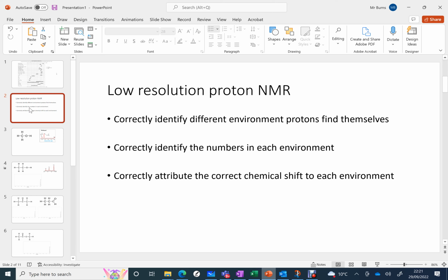So we've really got to familiarise ourselves with all these things. There's no point in Proton NMR, it can get a wee bit lost if you don't have the basic details of what functional groups are going to be found in an alkanol, for example, the OH group, or the carboxyl group in carboxylic acids.